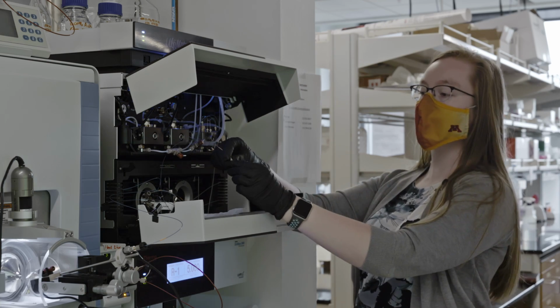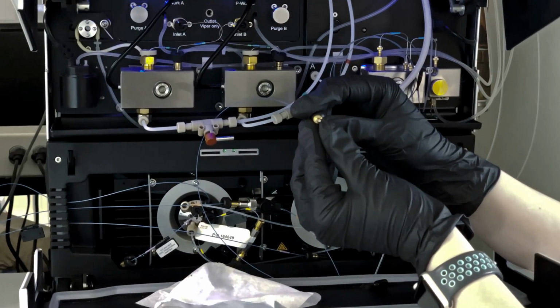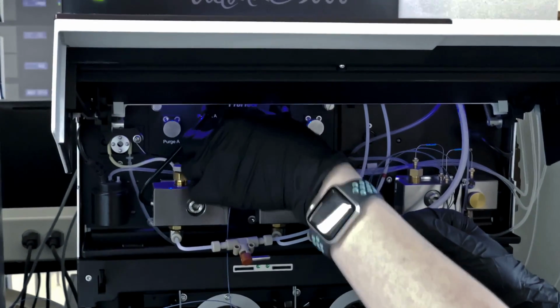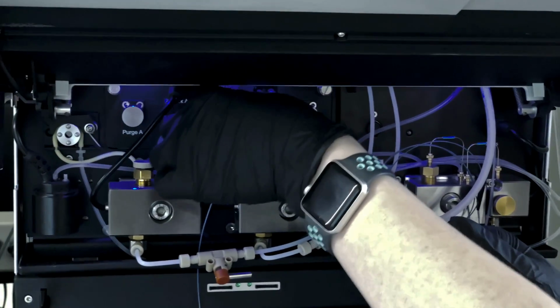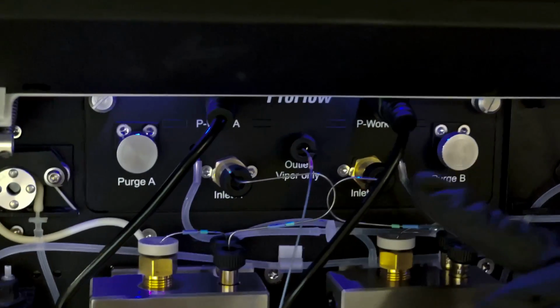the Viper outlet, take the cap back off of it, ensure that the seal at the end of the line is intact, and place it back into the Viper outlet. And here, same as the purge valves, you'll want to make sure this is finger tight. Over-tightening it can cause damage to the lines.